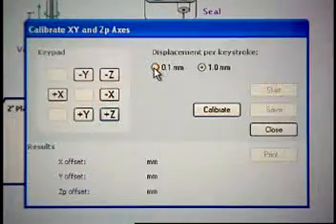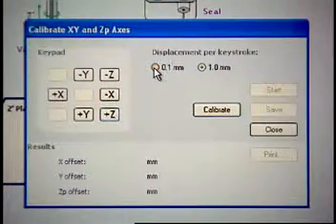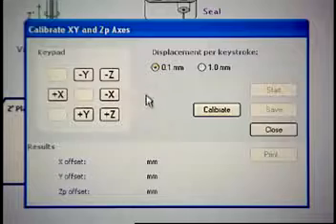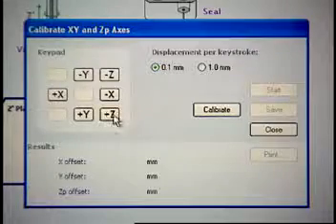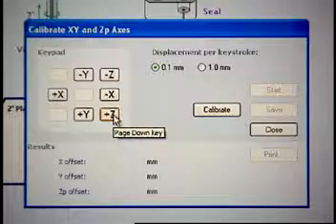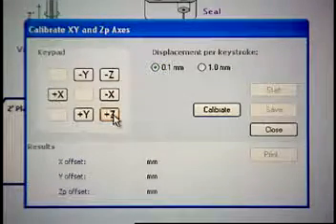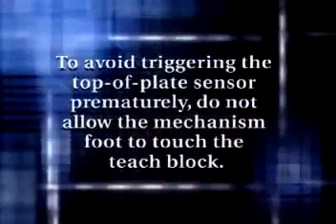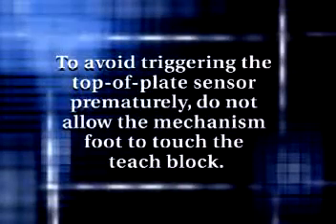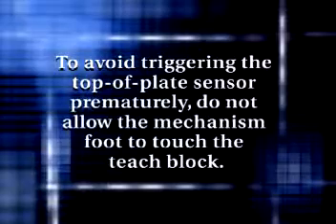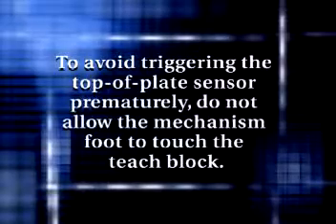Select the 0.1 mm displacement increment, and then fine-tune the adjustment so that the XYZ mechanism foot is just above the teach block, but not touching it. To avoid triggering the top-of-plate sensor prematurely, do not allow the mechanism foot to touch the teach block.